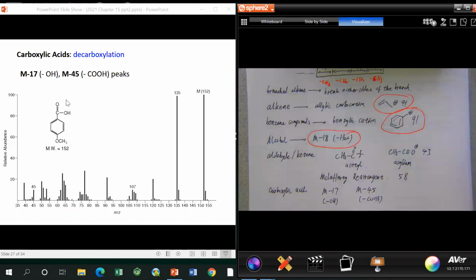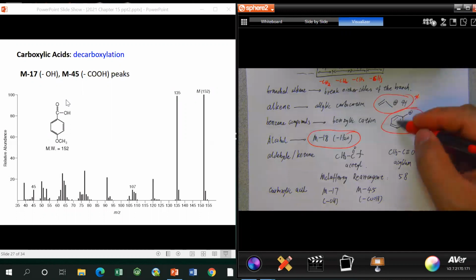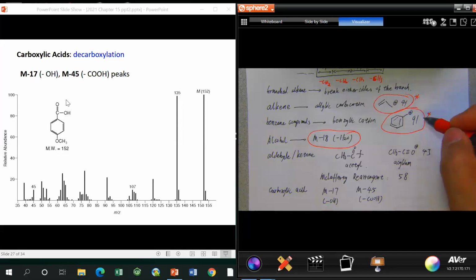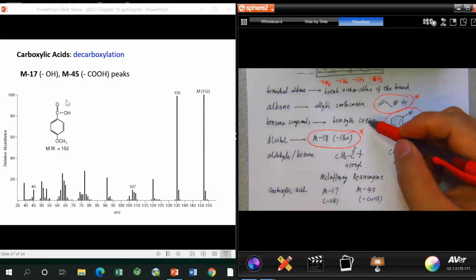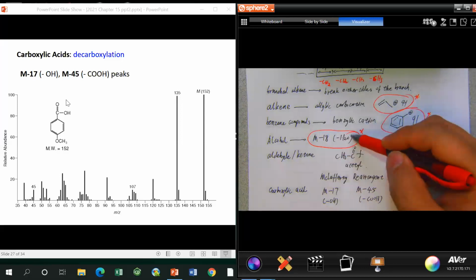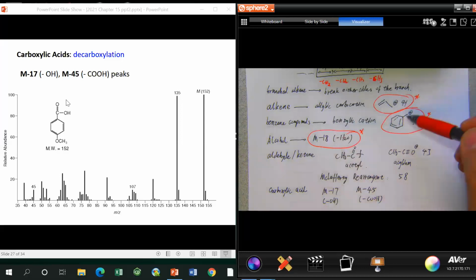What about the fragmentation overall? The most important are these three, which you have to memorize, because these three fragments have a quite unique mass and also high intensity. First, if you see the 41 fragment, 99% there is an alkene group in the molecule. Second, if you see a 91 fragment, that means there's benzene in the molecule. And last, if you see one fragment that is 18 less than your molecular mass, that means it's an alcohol. This mass will also be an even number. Those three, please memorize.